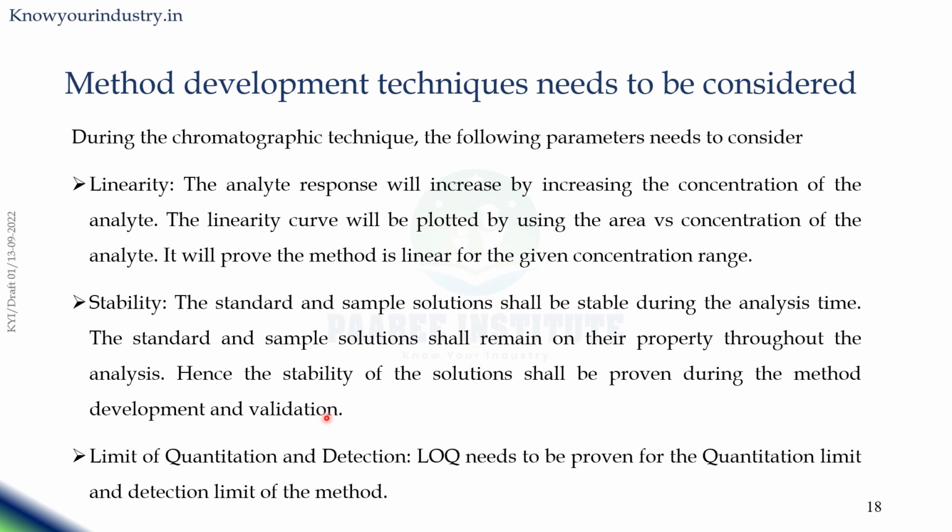So the stability of solutions should be established during the method development. You can inject the sample freshly prepared, then inject the sample after storing it for some time at a particular temperature, and see whether you get the same concentration both times. If you are not getting it, then the sample is not stable, and how long it is stable should also be established.